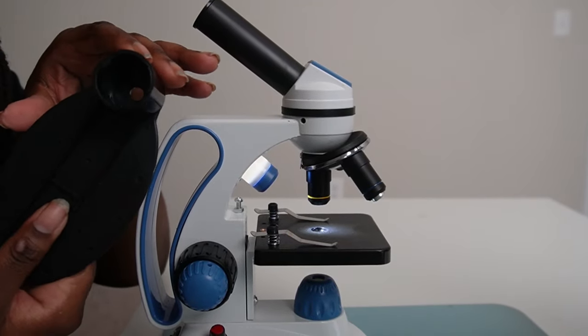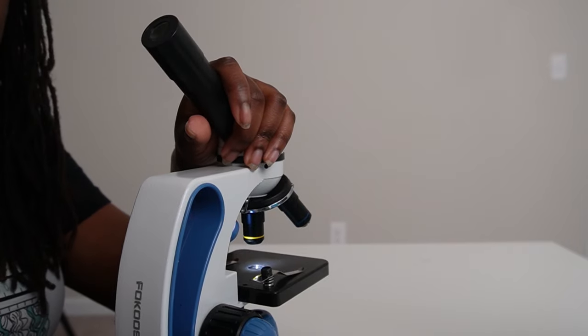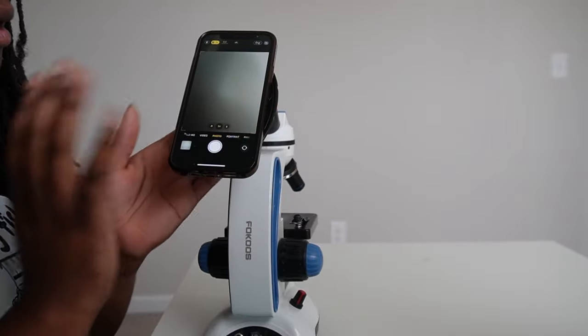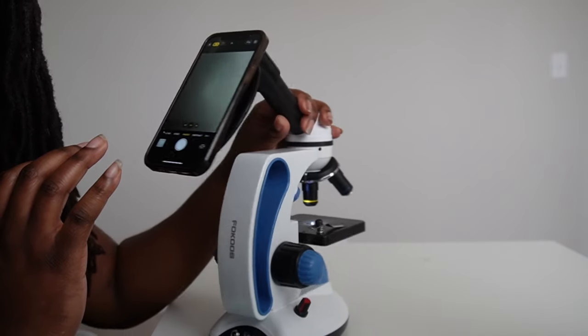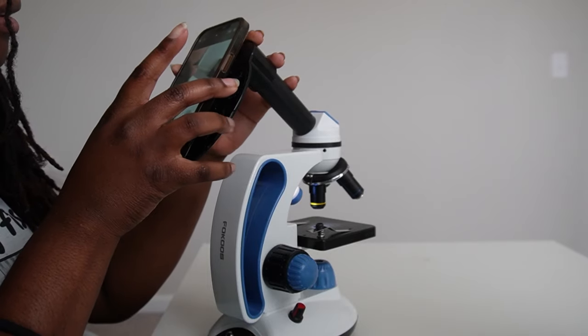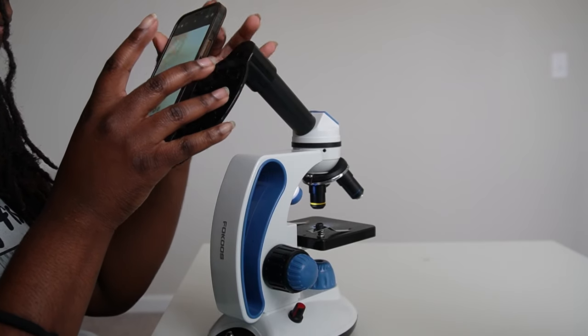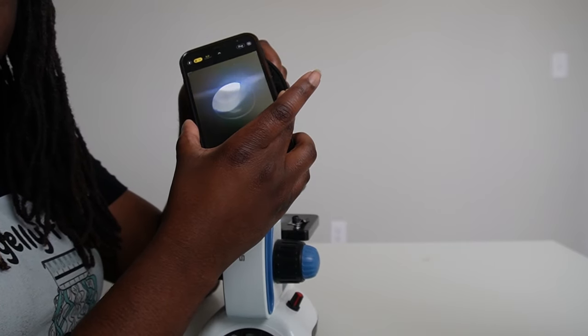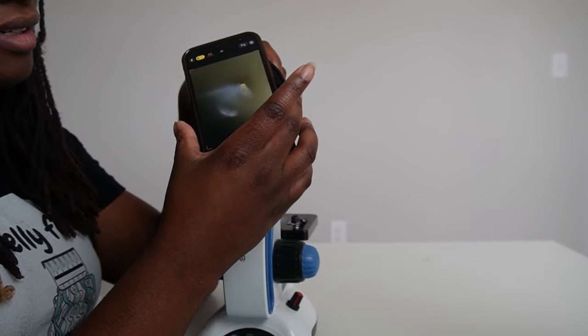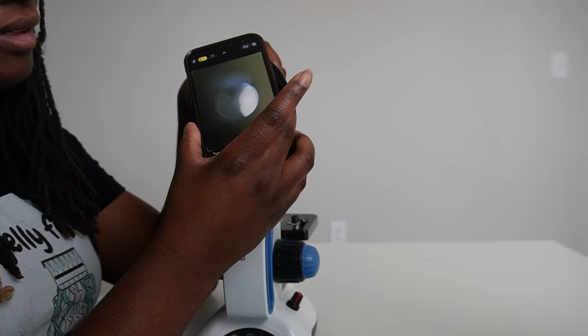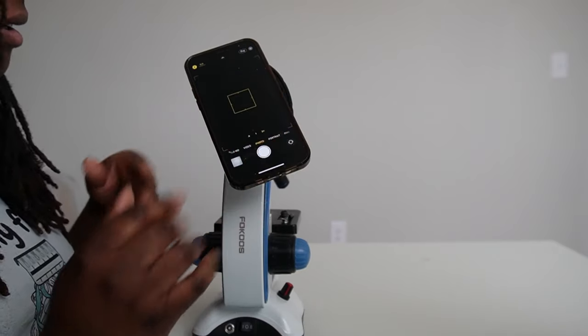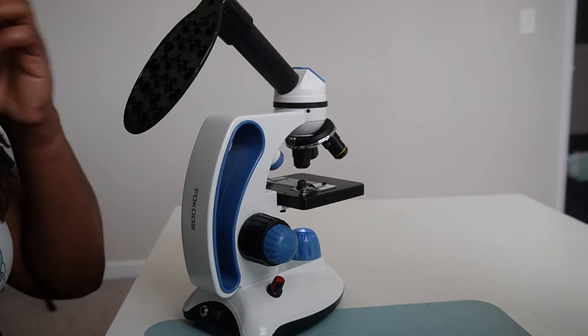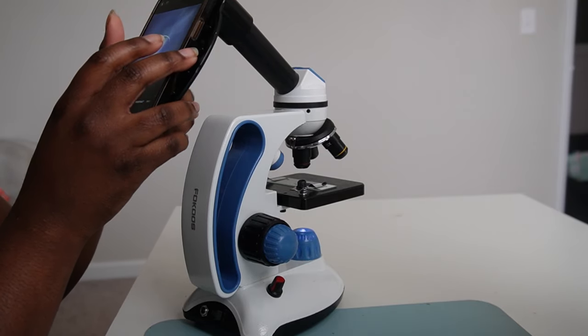So I do want to test out the phone holder. I would assume like my camera goes here? Huh, that's interesting. I was not expecting that to stay. Okay, see I can't get it like focused just right. We'll be here all day if I try to keep playing with this. Maybe I can do it. Now let me try again. I gave up really fast. Let me try again.